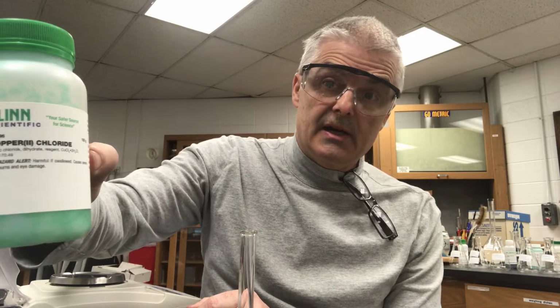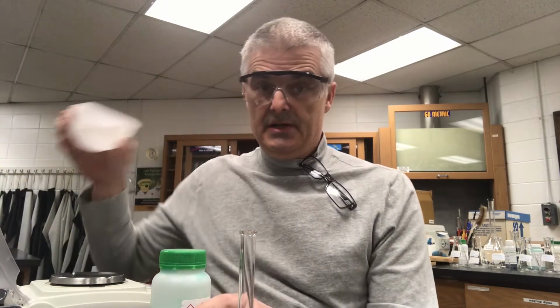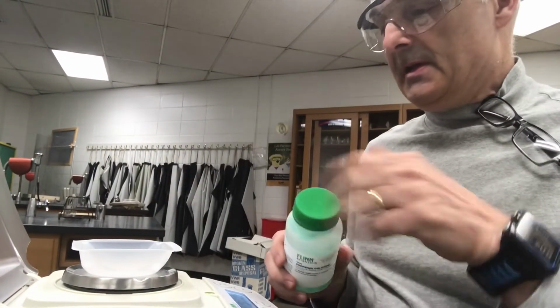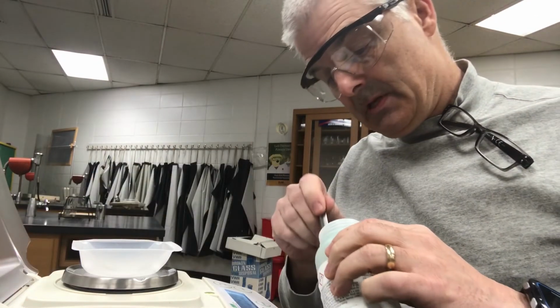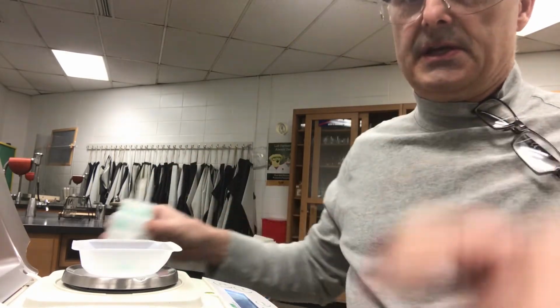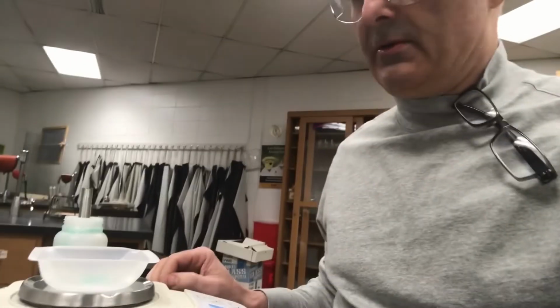So how do you make a solution from a solid? So here I have some copper chloride, copper 2 chloride, and I need to weigh out a mass. So I get my weigh boat, and I'll put it on a scale. You can see the scale right here. And you guys have done this multiple times, right? I'm going to push the 0 button on the scale. Add some mass to this. And usually you'd calculate what the mass might be. I add a mass to it. So in this case I have, looks like 0.491 grams.